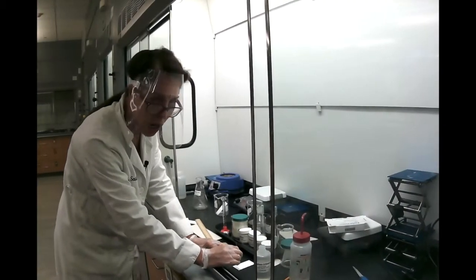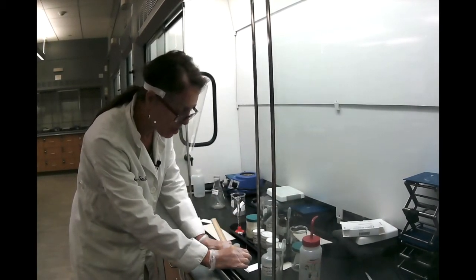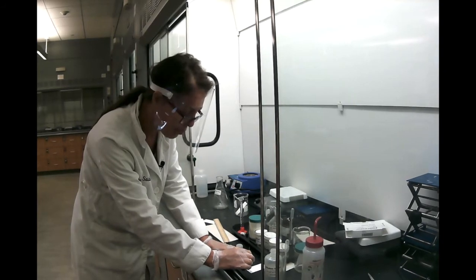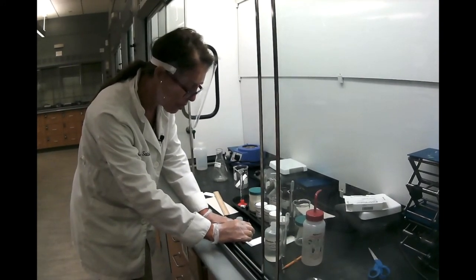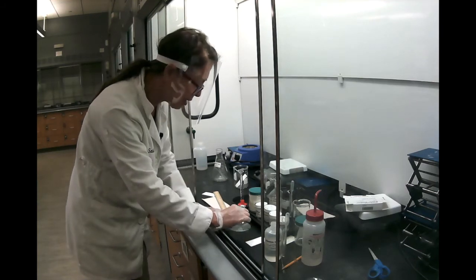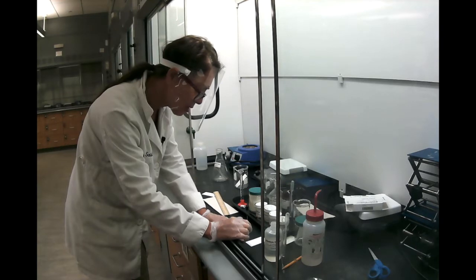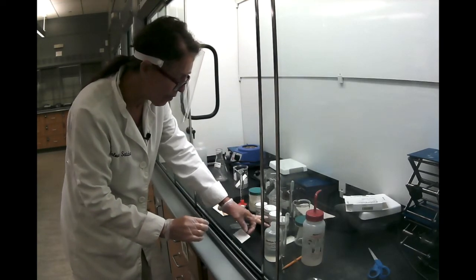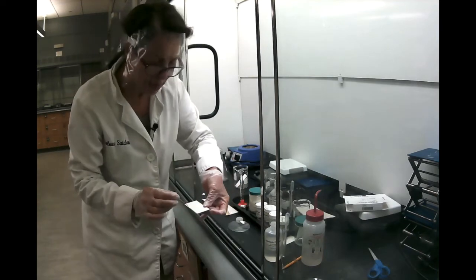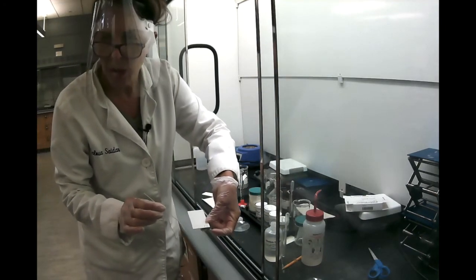Don't push too hard, because if you push hard, you're going to create a disturbance on the solid phase, and that will give you a bad path for your substance. It will move in a wiggly way instead of in a straight line. So all you have to do is just touch it, just like this. You have about a 1 millimeter spot of liquid in there, I don't know if it's visible.